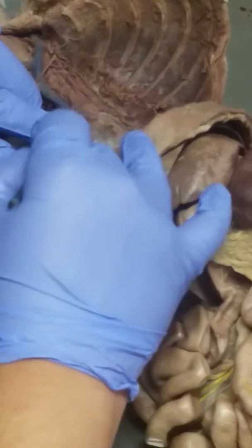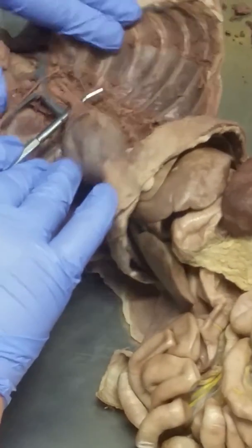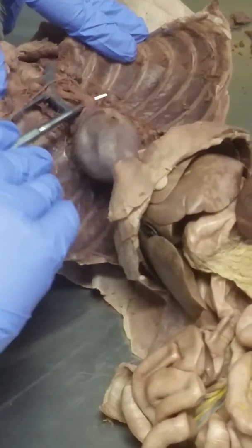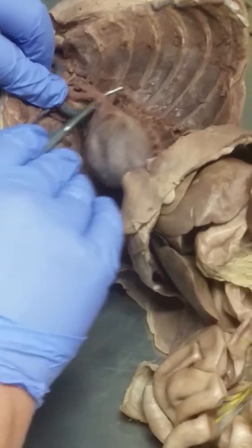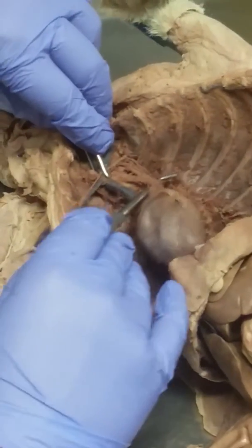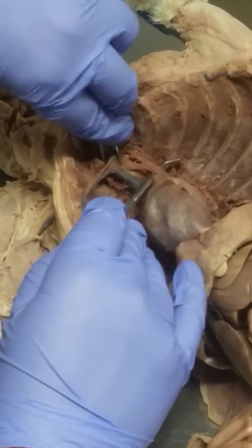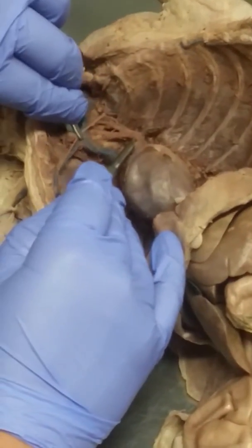Well, when you're in the aortic arch, you see this vessel. This vessel is the pulmonary trunk. Sorry, is the brachiocephalic trunk, right? Notice as I tug on it, it's tugging on 3 other vessels that are coming off of it. See that? See how it's tugging on 3 vessels? The third one is like somewhere over here, right?